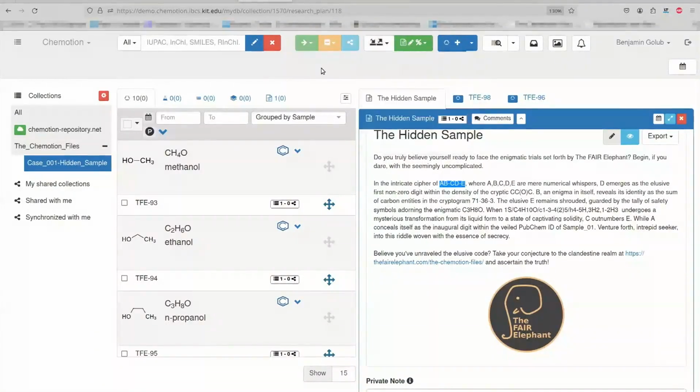So, and these are all the small steps I try to do with this gamification aspect. And in this case, we are putting it into a new context. Don't think about these things, just do the things and move around a little bit in the ELN, right? And the core feature here in this very simple first case was the sample. How can I look in the ELN for different samples, right? What are these cryptic descriptions of samples, because they help me to find samples as it look like, right? We have here very different ones, and in some way they help me to find what I'm looking for.